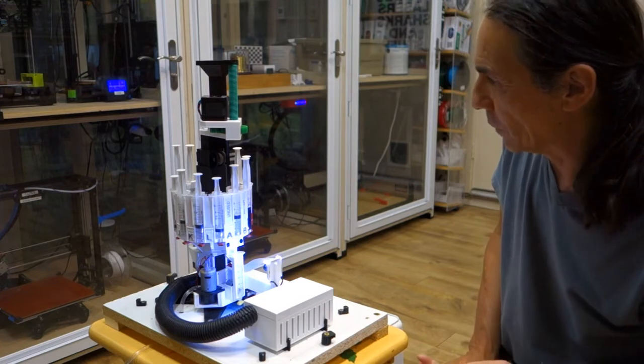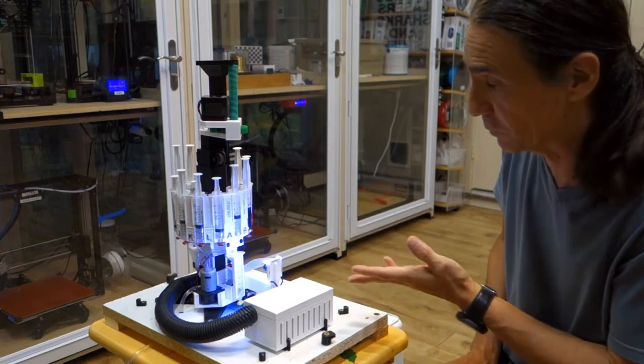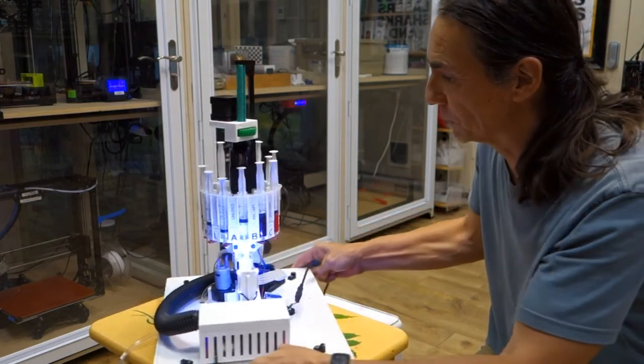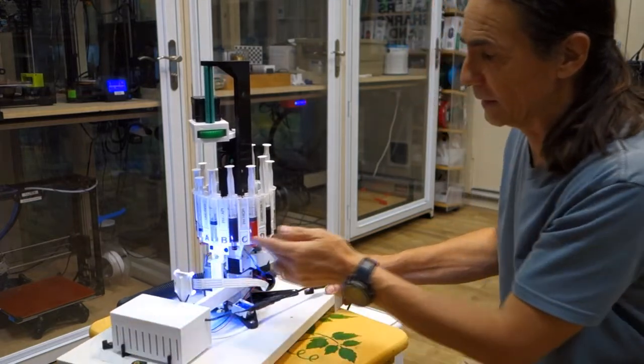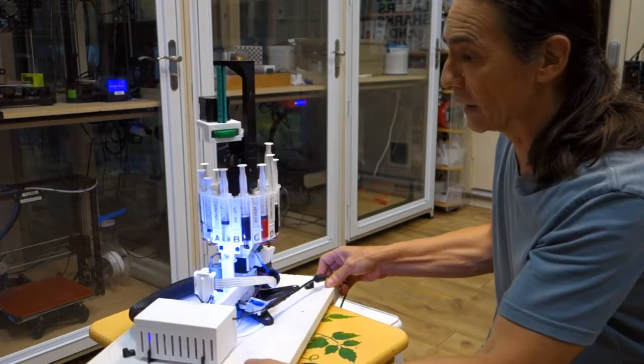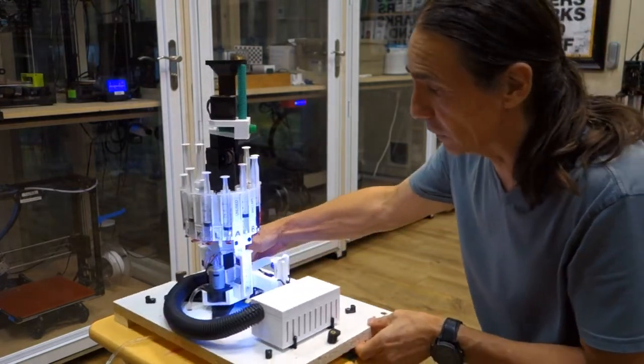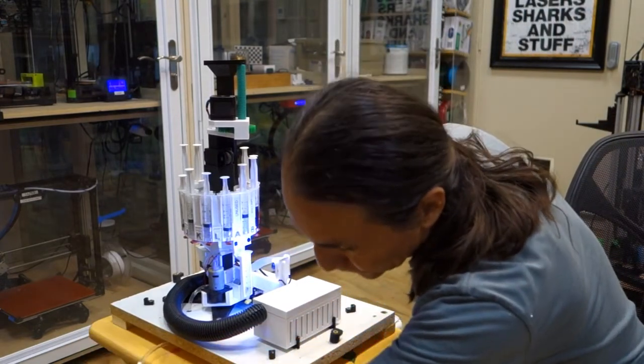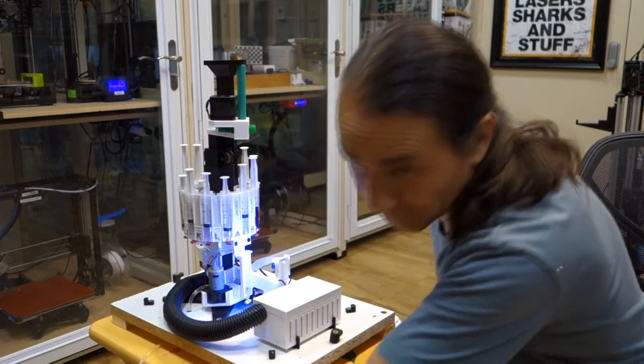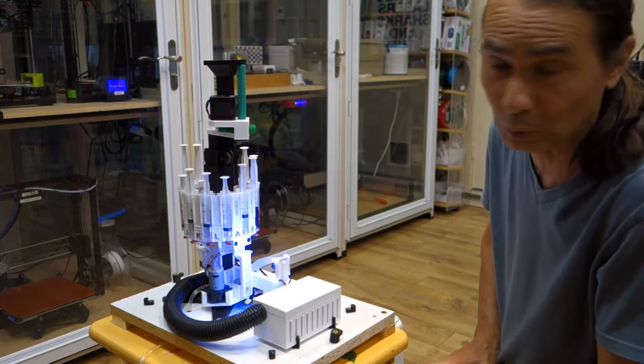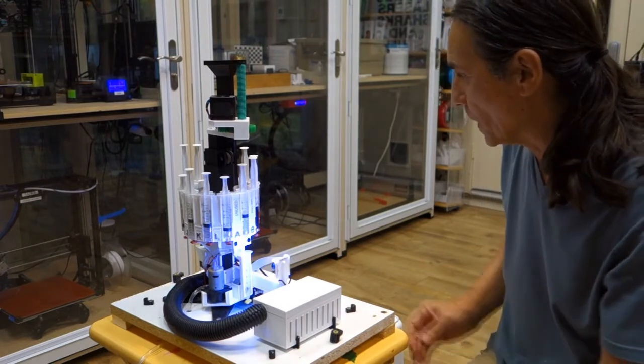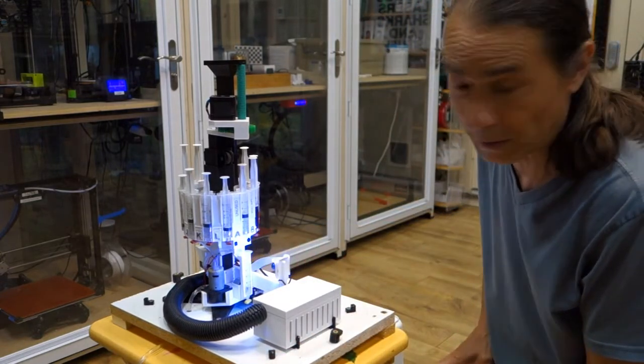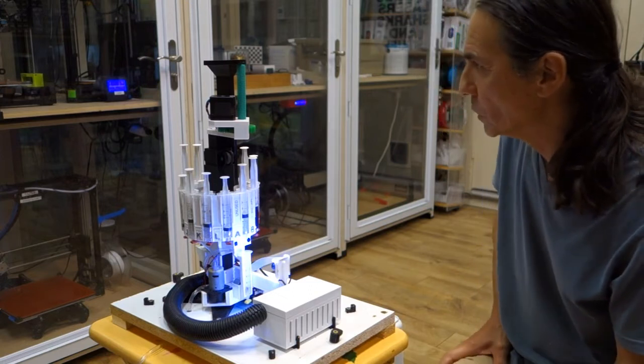So what we have here is a system that runs colorimetric tests. Now it's loaded up right now with reagents from the API test kit. But it'll actually run any tests that you have that are colorimetric. Right now it's just drawing in water from a jar of tap water and the exhaust is going down into another jar. But the idea of course is that this will pull in water from your aquatic environment that you're trying to measure.